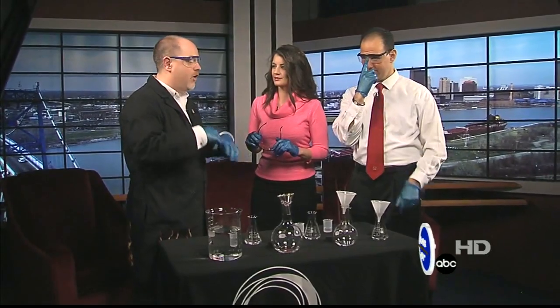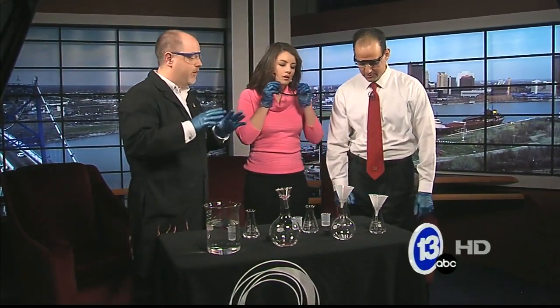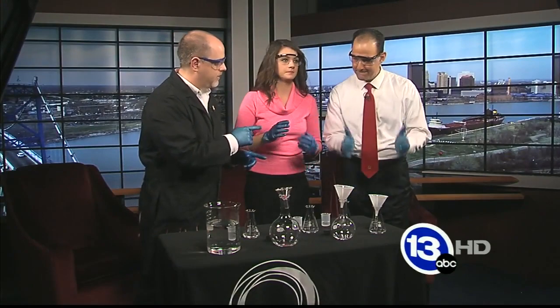Now the reaction takes about a minute to happen, so we better get started. We're going to start pouring stuff and then we'll talk about what's going on. Safety glasses and gloves on — good to go.